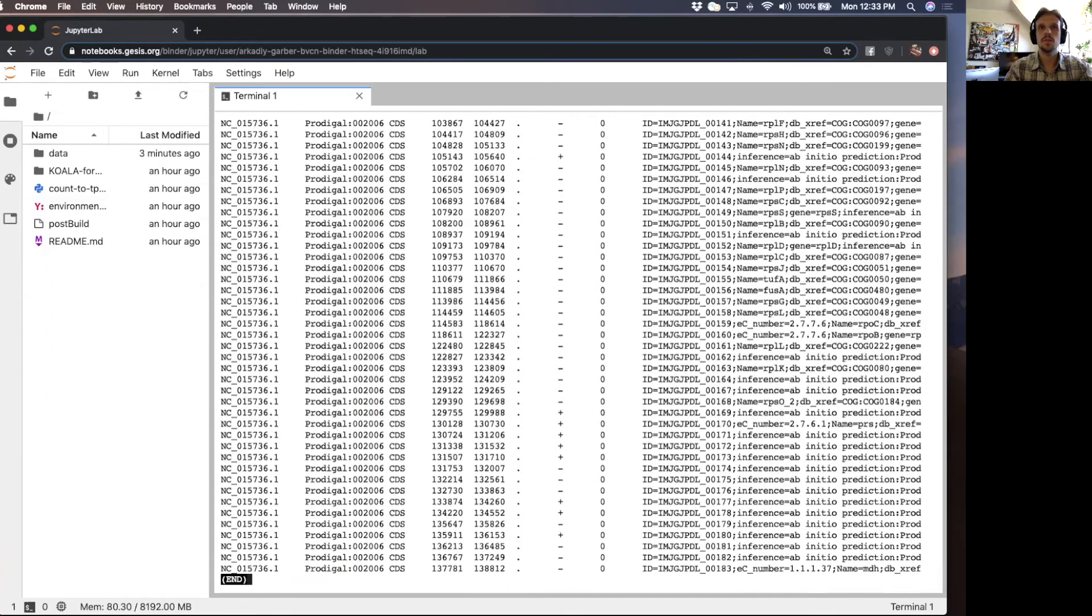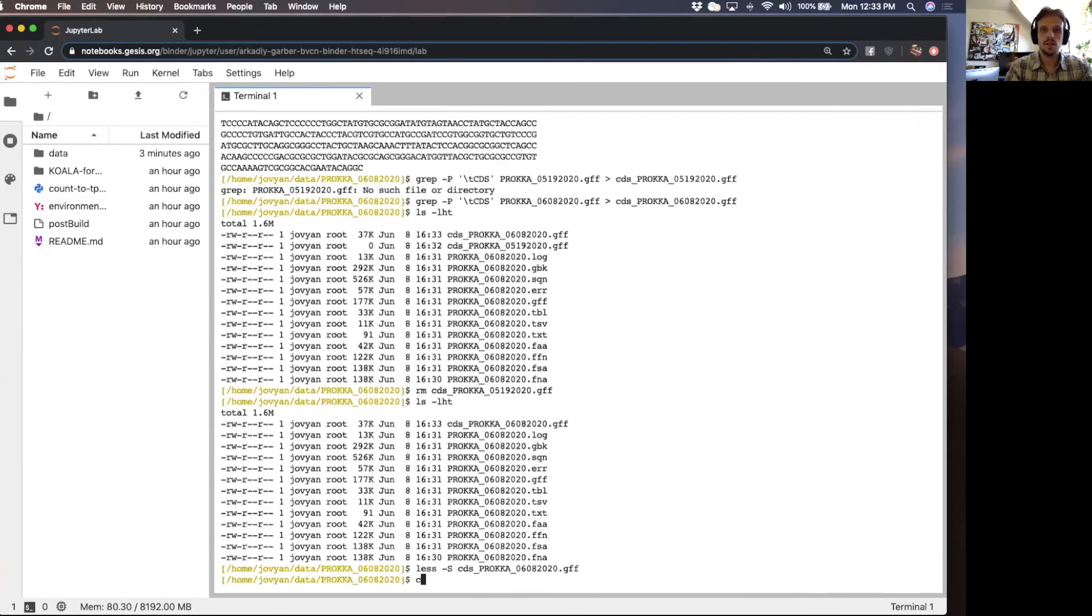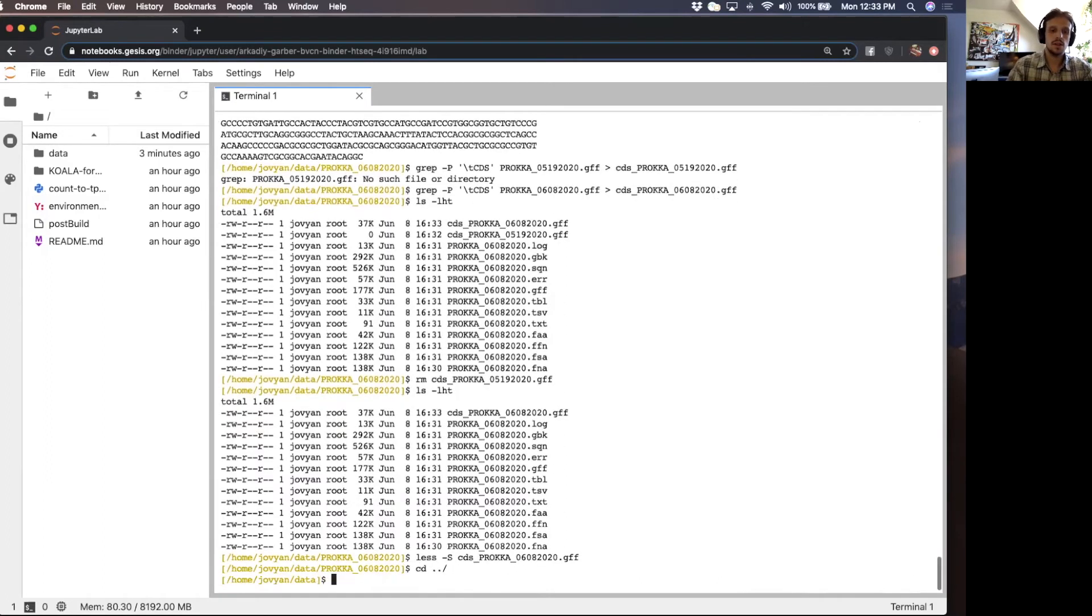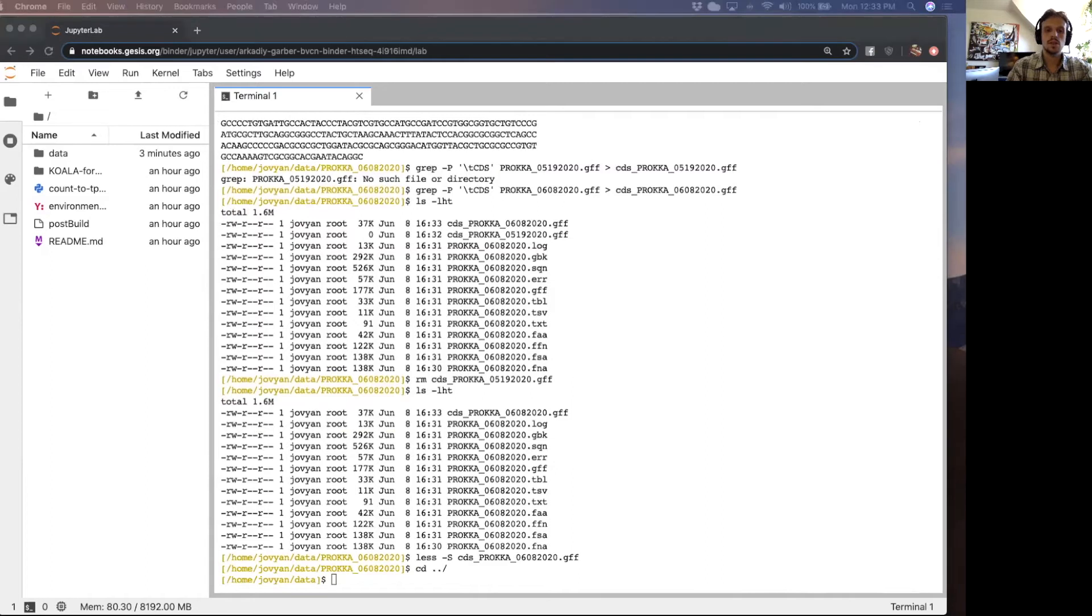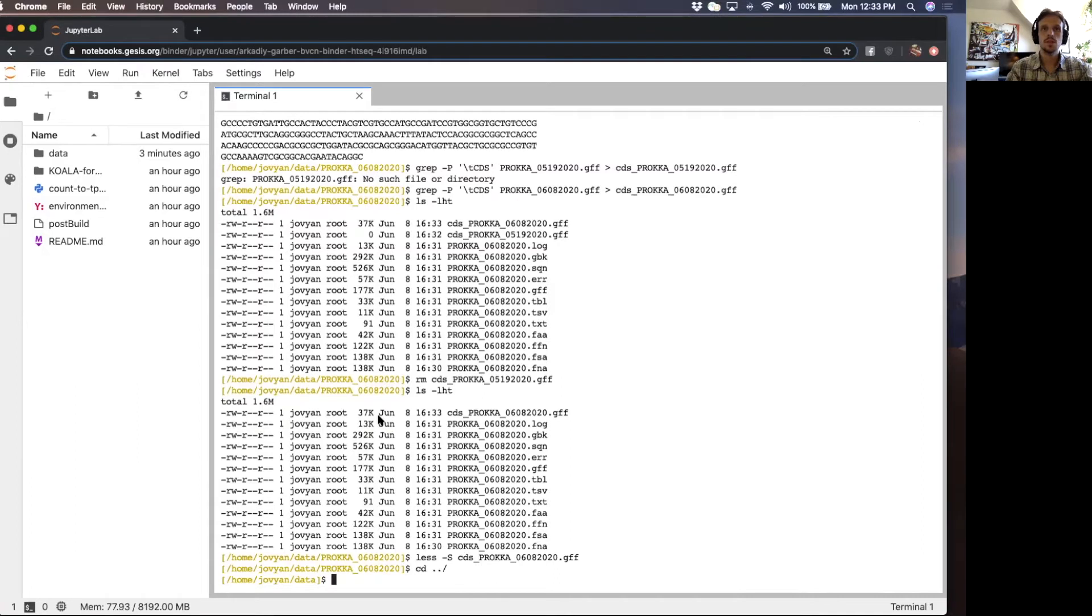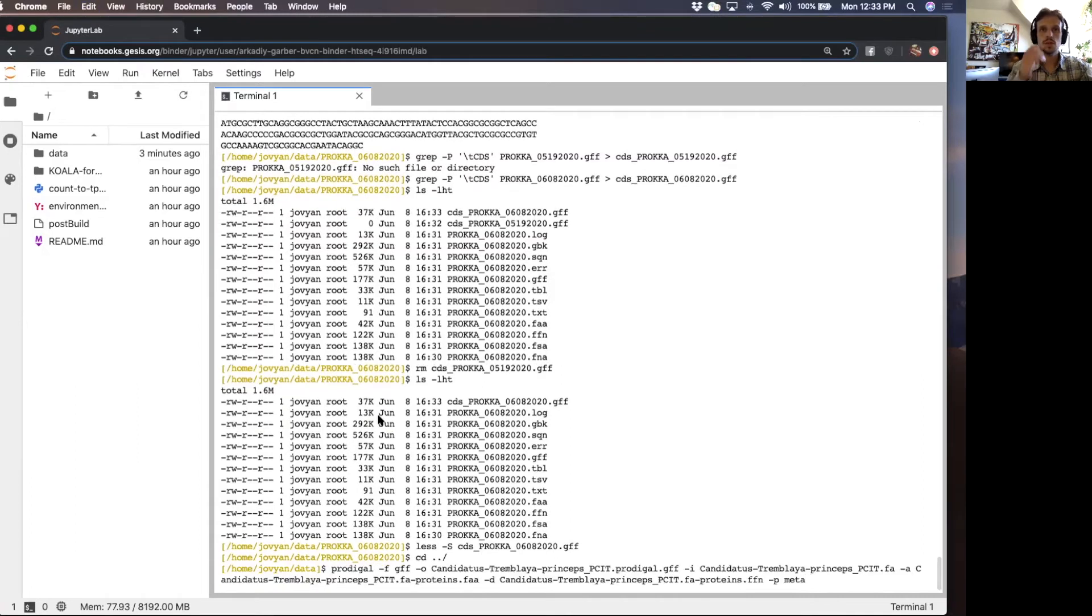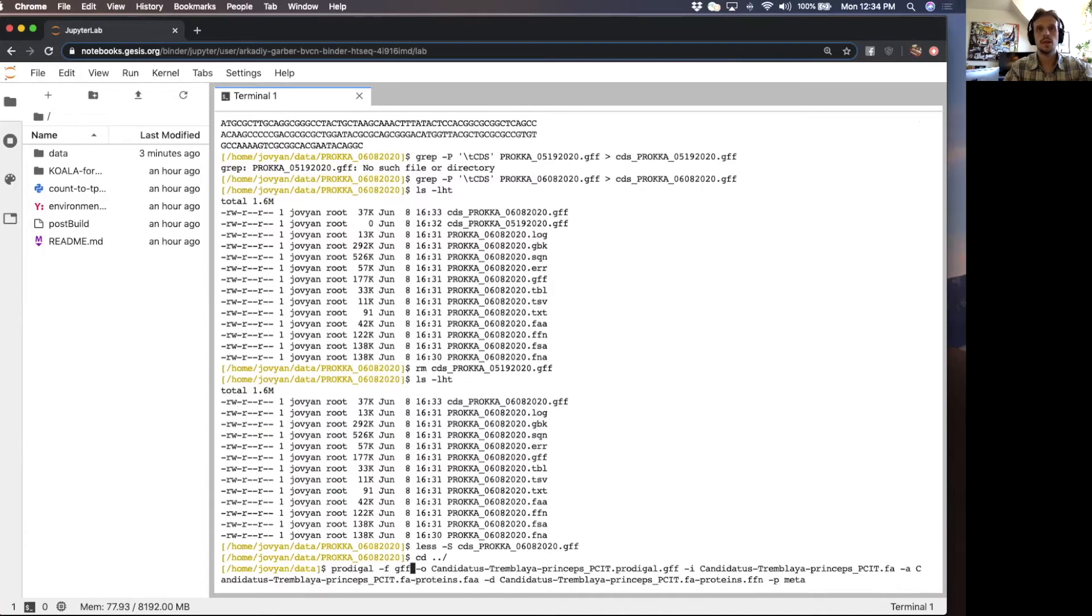Now that we've pulled out, let me remove this because that's not the file we want. We've pulled out just these lines that match a coding region from the genome.